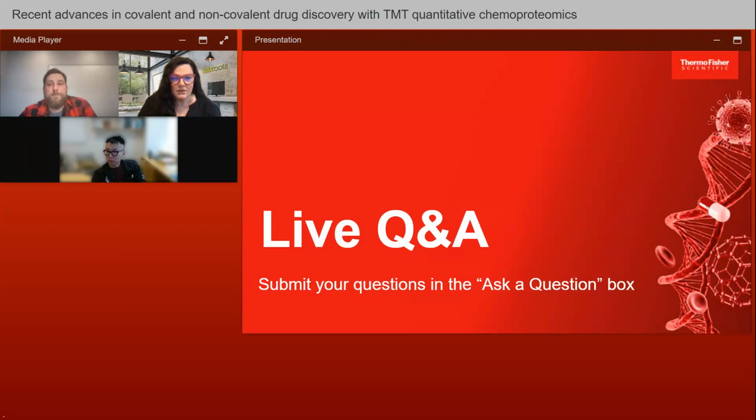All right, thank you so much. This next question is regarding the last slide. I'm not sure if we were talking about Qing's presentation or Alexey's, but you two will be able to decipher that. It's a longer question. In your last slide, you were able to detect the ligand-modified cysteine peptide. Was this from a targeted GoDig method, TMT, or DDA method? And then I do have a part 2 to that, so if you'd like me to break that up into 2 parts.